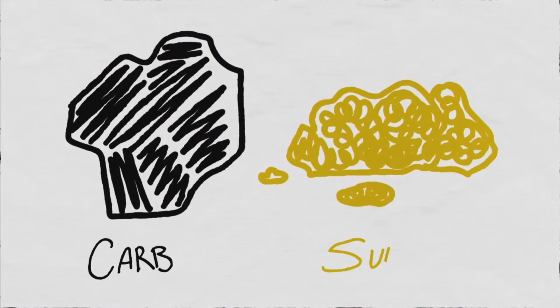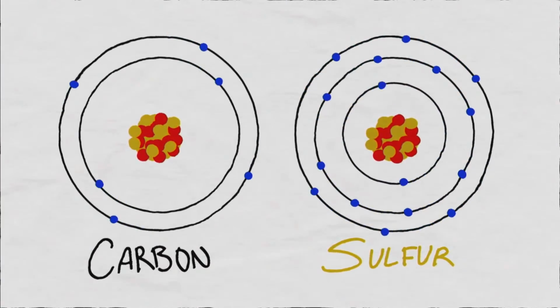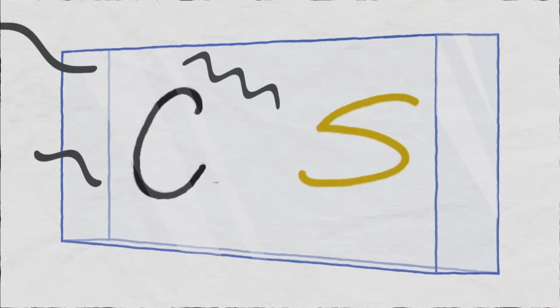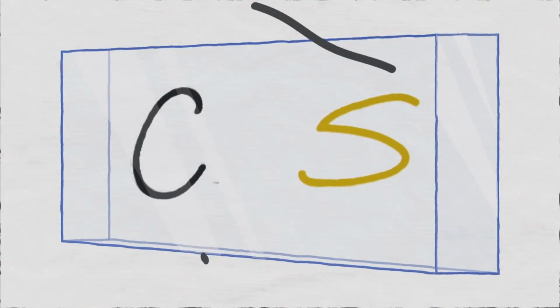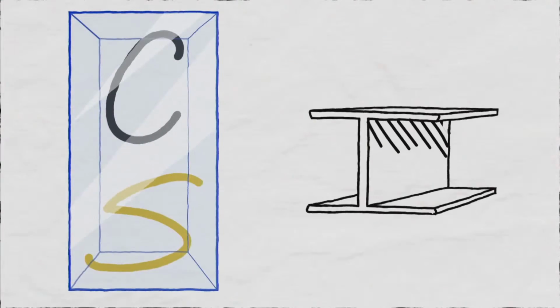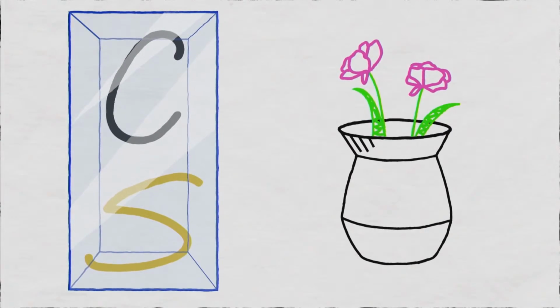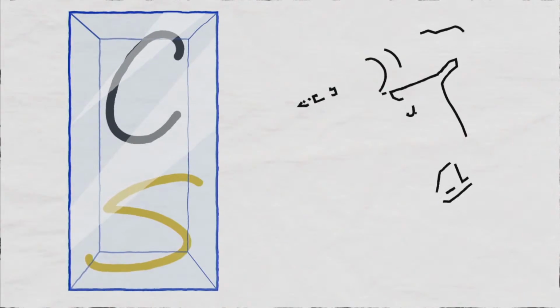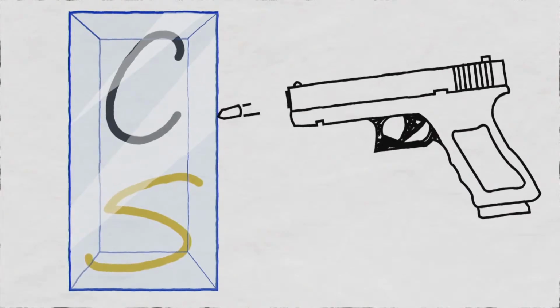The amount of carbon and sulfur in a material can have tremendous impact on its physical and chemical properties. Yet these elements can be very difficult to measure by direct spectroscopic methods. This is especially true when embedded in inorganic matrices such as iron and steel, cement, limestone, and glass or ceramics. But if the carbon and sulfur can be coaxed from their formidable fortresses, there may be a way to easily and accurately measure these elements.